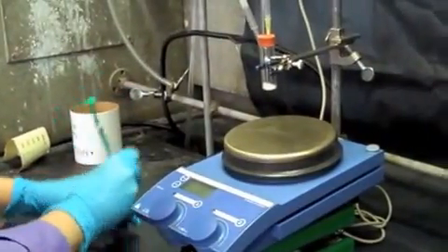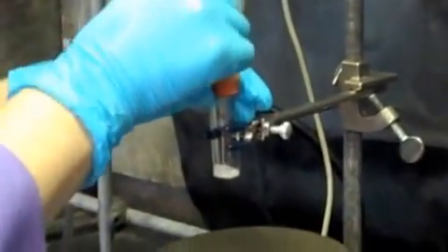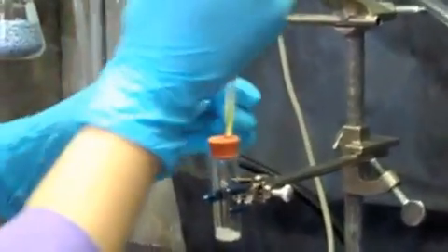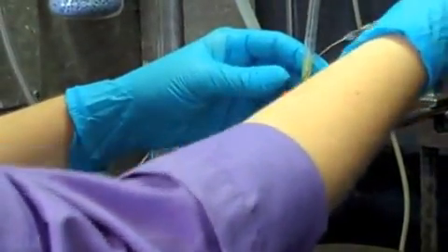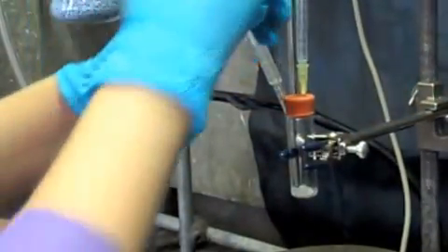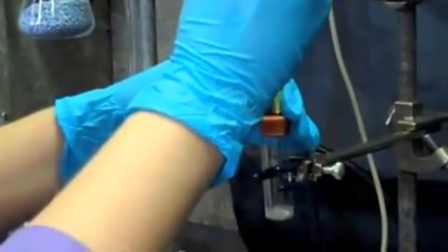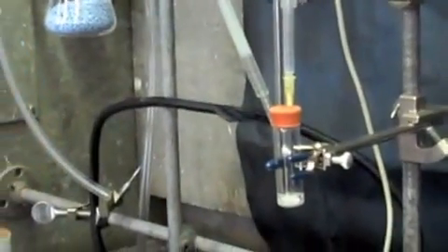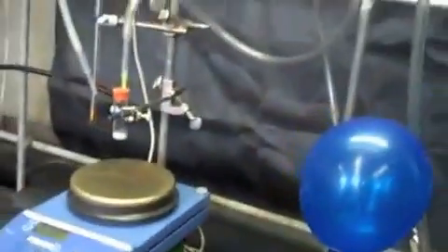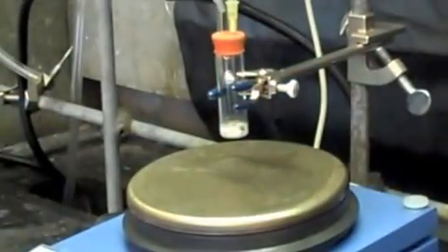Note that I acquired the THF from the dry solvent shelf and not the THF in the flammable cabinet. That's not sufficiently dry. I'll take my needle and, using care, pierce my septum. I can now dissolve my solid using the needle to rinse the sides of the flask that might have a little bit of N-pivaloyl o-toluidine stuck to them. I remove my needle and throw the whole thing into the sharps container. I can now lower the reaction and turn on the stirring.